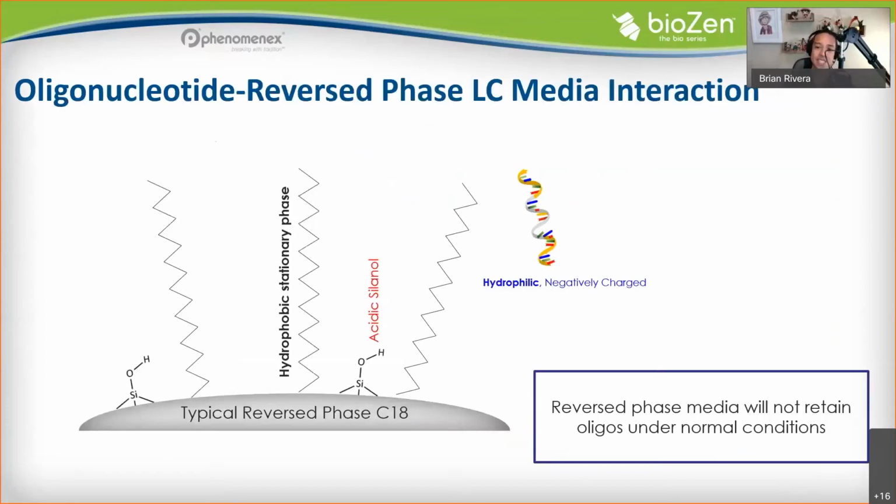And so, the chromatographic challenges. Obviously, oligos are very challenging to work with. Before we start to talk about method optimization by ion pair reversed phase, just a brief primer on reverse phase LC itself. This involves the partitioning of an analyte between the mobile phase and stationary phase, with interactions typically driven by hydrophobic mechanisms. That's the reason why we use C18s, for that methylene selectivity.